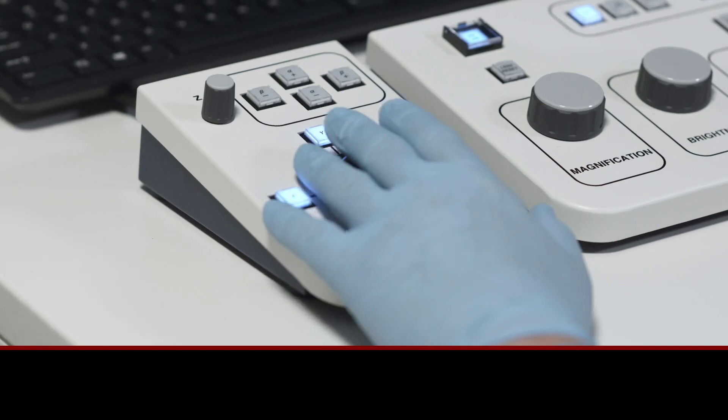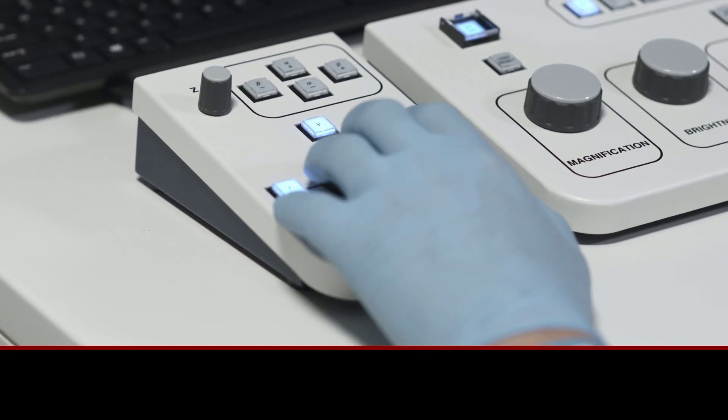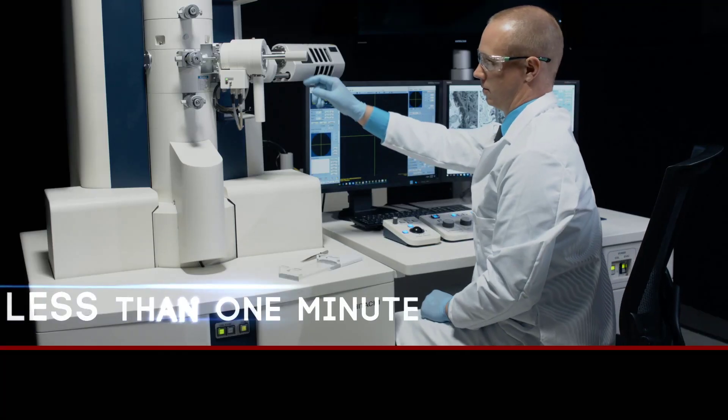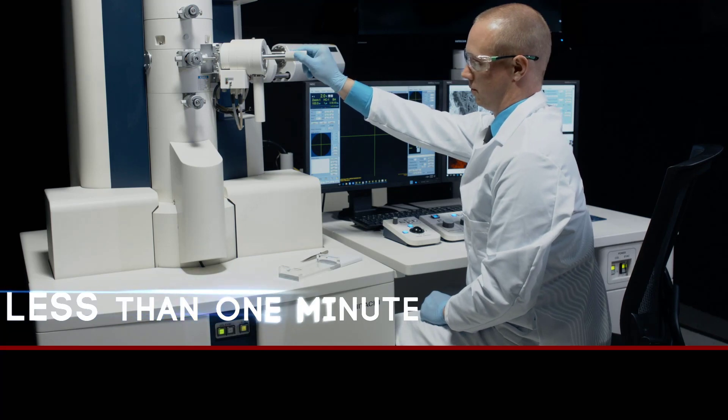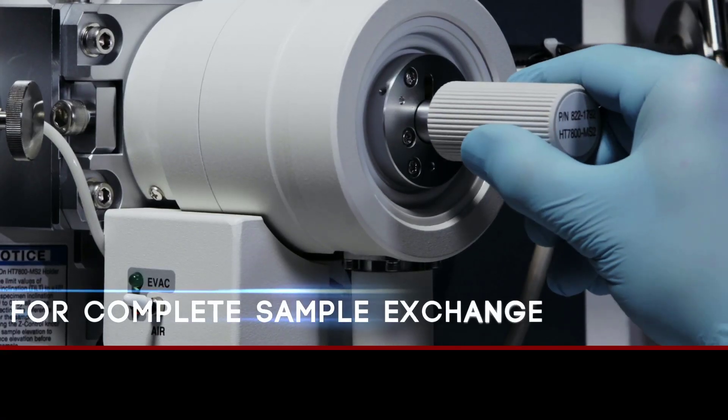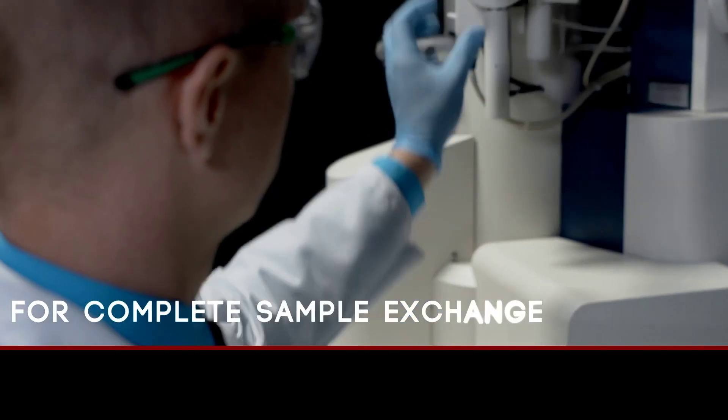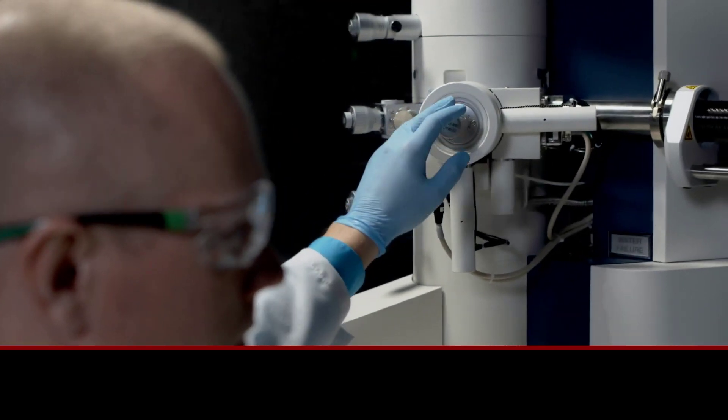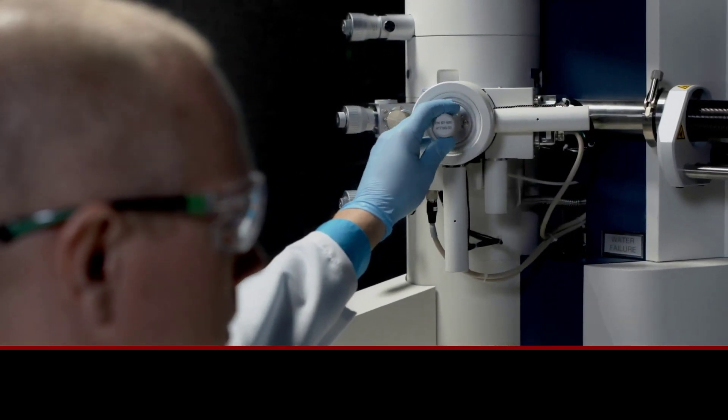Ergonomic integrated controls deliver efficient operation and effective results. Keeping efficiency in mind, the HT7800 features modern digital technologies as well as an advanced vacuum system to achieve a compact design capable of high-throughput analyses.